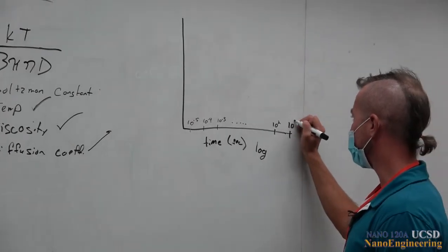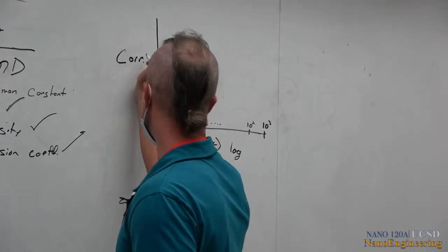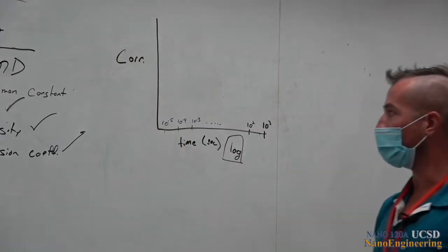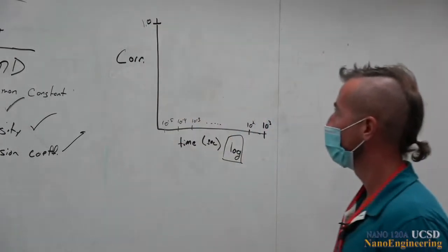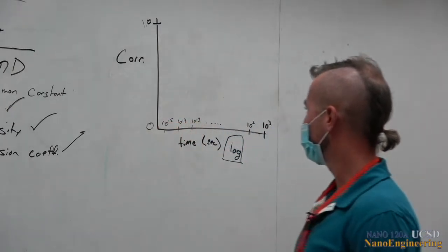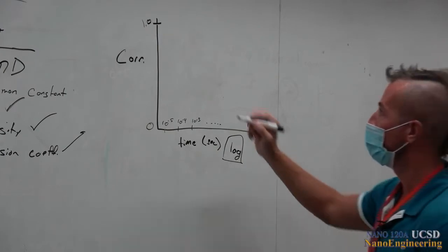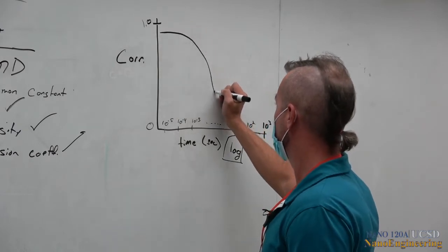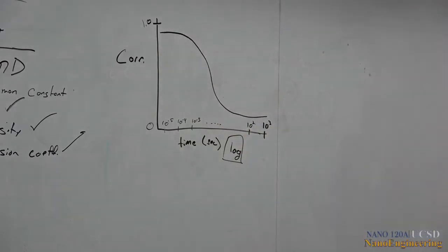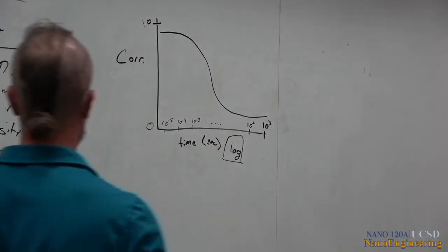This is one of those parameters that you can change. And again, we're plotting this correlation. But the difference now is this is log. Okay? And what this is going to look like is something like that. I'm going to get rid of my little marks just for clarity.